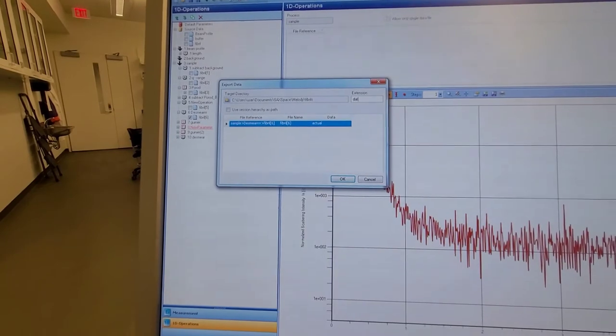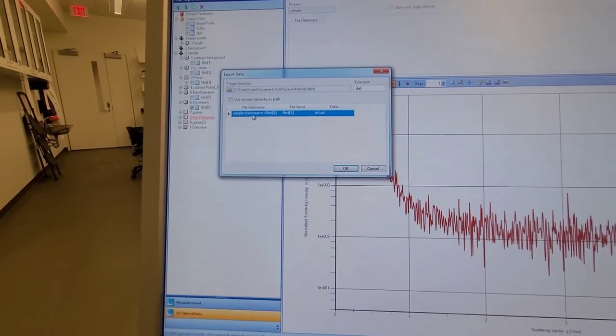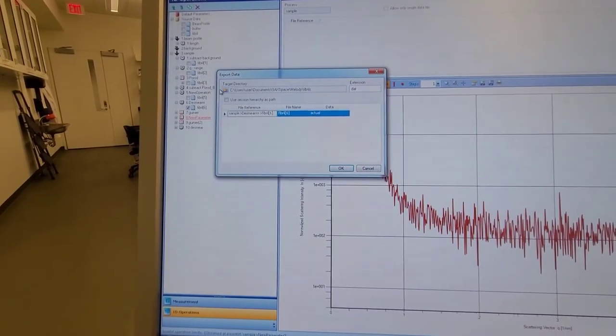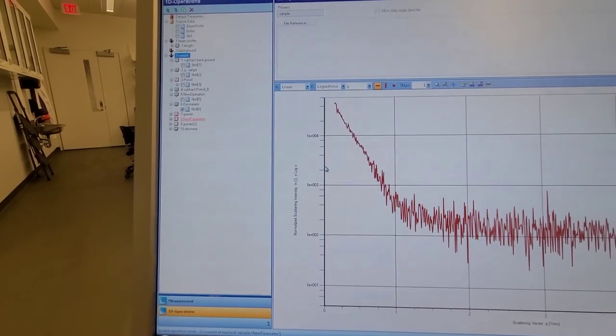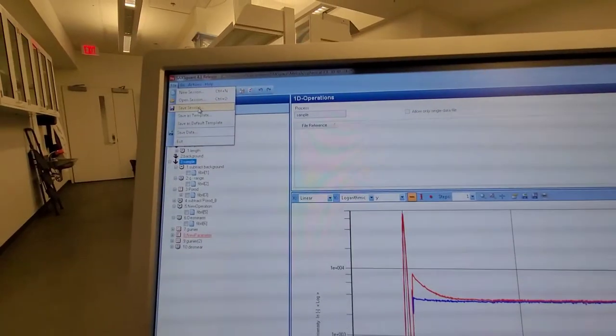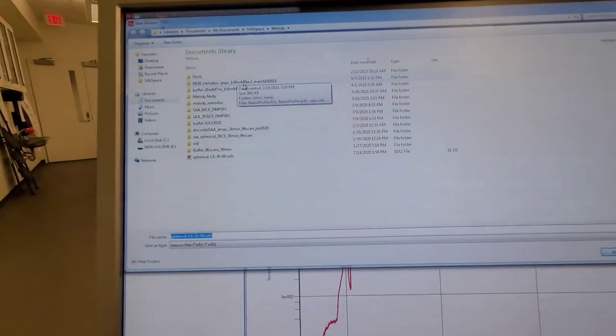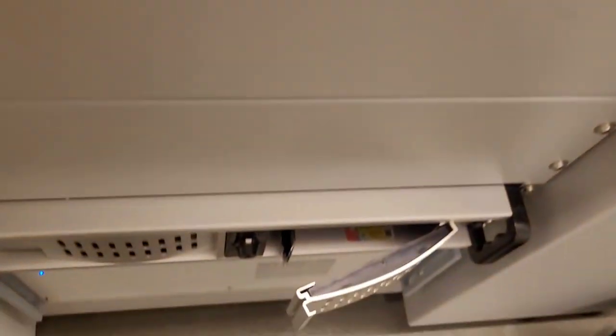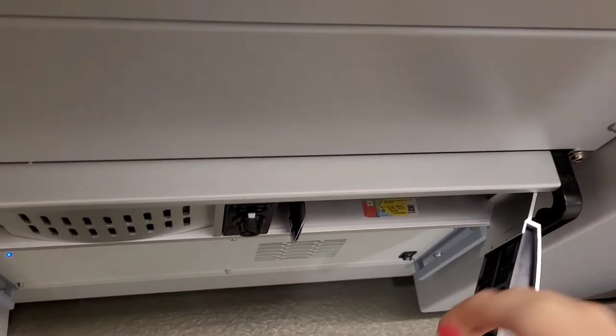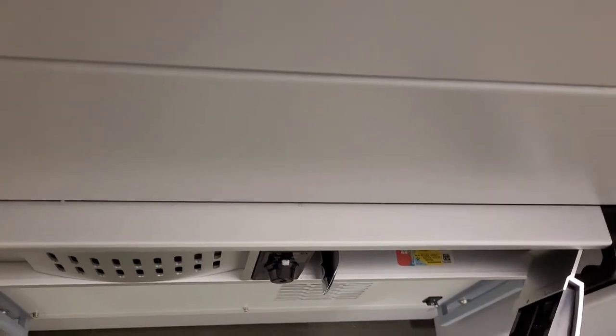This is the one that you need for anything else. This is the useful data. And then you save that as a .dat file because all the processing softwares after that use the .dat file. Save the .dat file onto your USB and you're ready to go for further processing.